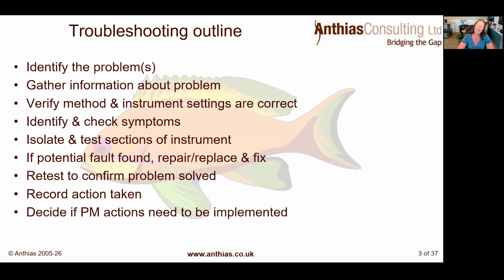We then want to go and isolate and test different sections of the instrumentation. So I'm going to go through in a minute just how to break down that instrument into different parts. If you look at the instrument as a whole, there's lots of different things going on.